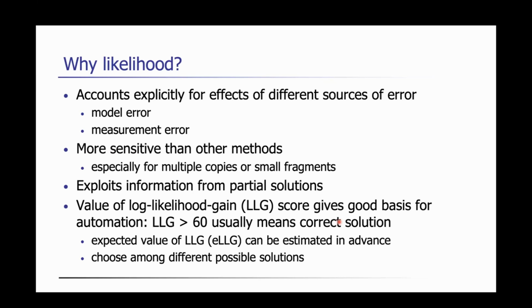Now, the likelihood is a probability, and if you have probabilities of thousands of observations, you multiply them together, you get very small numbers. But if you take the logarithm of that, the logarithm goes up at the same time the likelihood itself goes up. And the log of the likelihood actually has some other nice features mathematically. Then the gain part is you can say, well, I've got this number, but how do I put it on an absolute scale? And the gain is how much better can I predict the data with this model than if I said I know nothing. And knowing nothing corresponds to having a model with infinite errors. That's how you can approximate that.